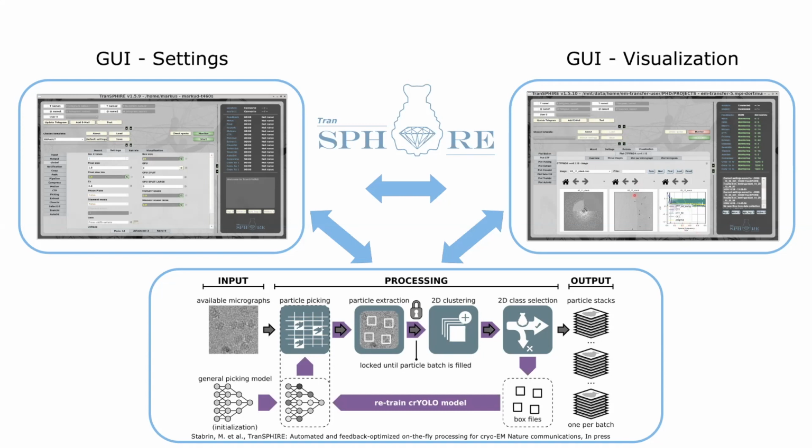And the same is true, for example, for drift or picked particles, because some squares are better or less good than others. So you might want to optimize your data acquisition so that if you collect your 3000 micrographs within a session, those 3000 micrographs also have the quality that you need in order to reach a high resolution structure.